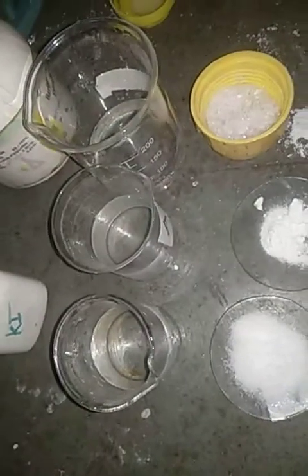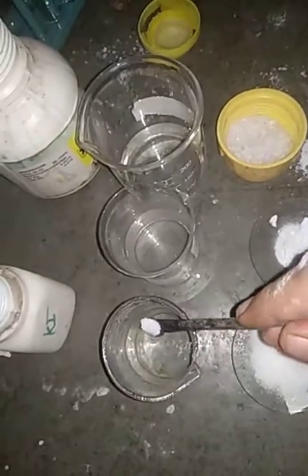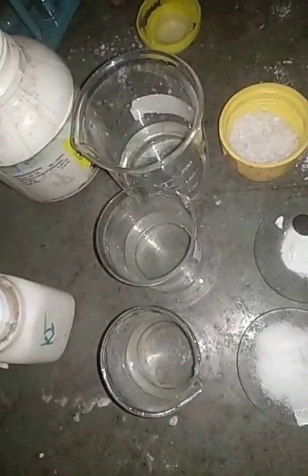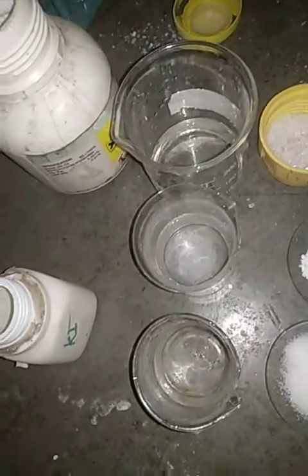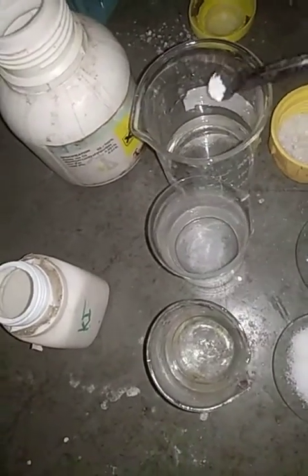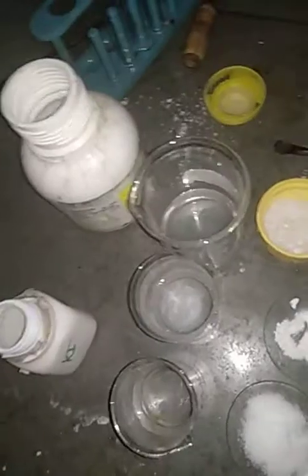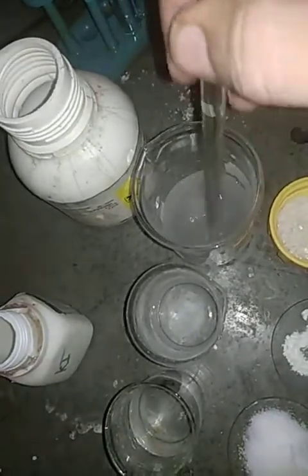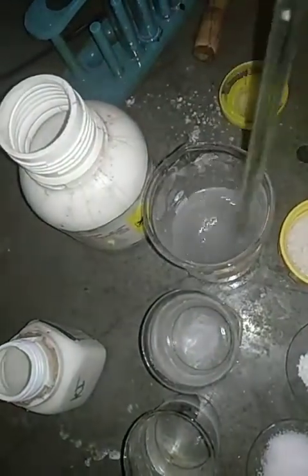In each beaker we are going to add some crystals: first we'll add the sodium chloride, then we shall add potassium iodide, and then we are going to add this barium chloride, and let us dissolve them well. You can see that the crystals have been dissolved.